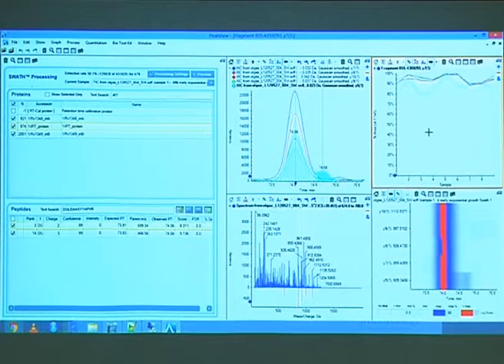However, that one always looks very noisy to me. Even if it looks kind of good in absolute terms, so I usually look at that one in this way. Down here, what you see is again the spectrum at the apex.